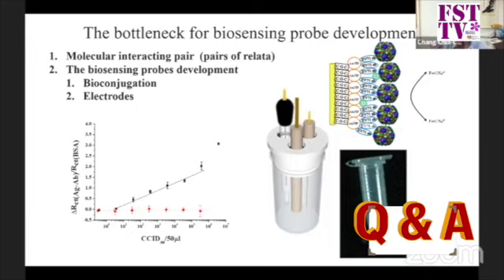But if they are novel infectious pathogens, it's not easy to know what kind of protein they are or what kind of sequence they have. However, their sequence is quite easy to get. So that's why we try to use the typing approach, which means we can detect some specific DNA or RNA sequence. By using these kinds of approaches, it will be faster to detect this kind of structure.